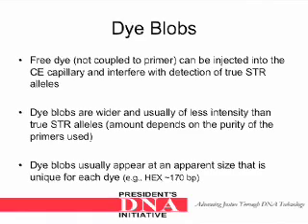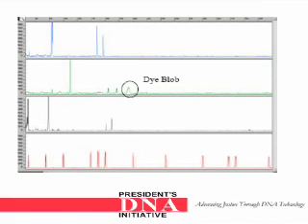Dye blobs: free dyes not coupled to a primer can be injected into the capillary electrophoresis capillary and interfere with the detection of true STR alleles. Dye blobs are wider and usually of less intensity than true STR alleles. The amount depends on the purity of the primers used. Dye blobs usually appear at an apparent size that is unique for each dye. This electropherogram shows an example of a dye blob, which is shorter than the main peaks and also wider.